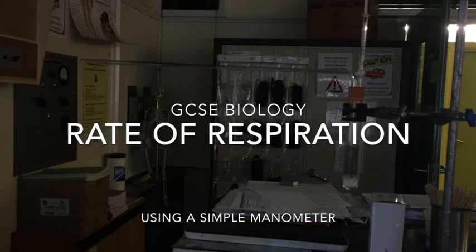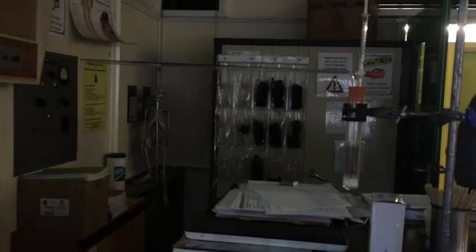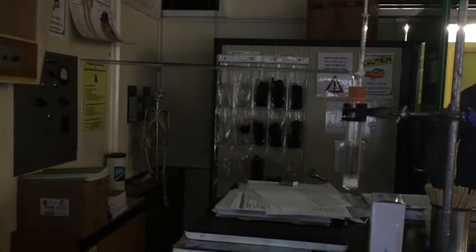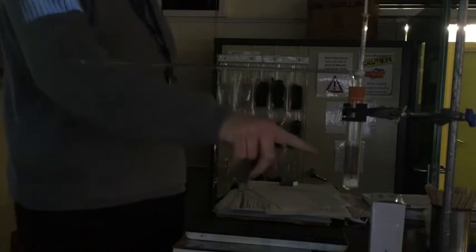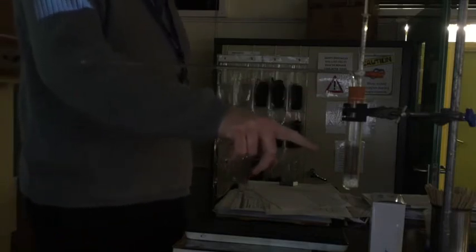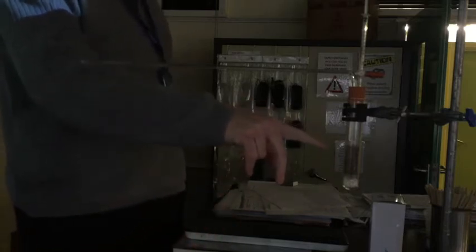Okay, so what we've got here is our basic respirometer. It's only a basic respirometer because our more complicated ones can actually have two tubes, which I'll explain later. Let's take you through the parts of the respirometer. So first of all, we have got a simple boiling tube here, and in a little container here we have got some organisms which are going to respire aerobically, and those are just some maggots.